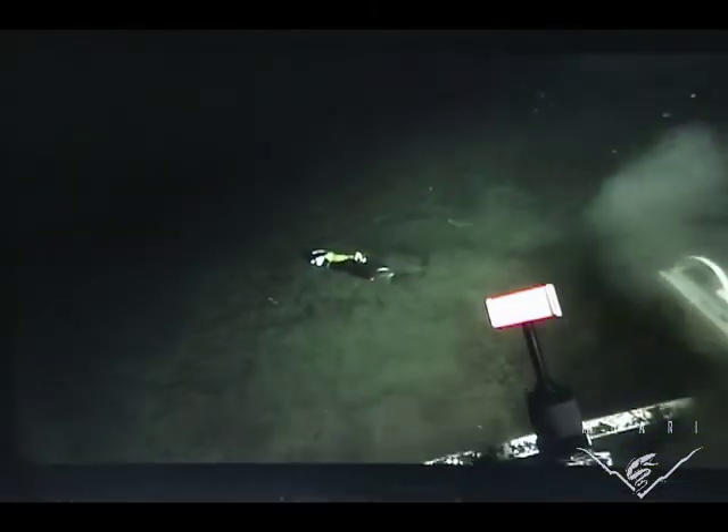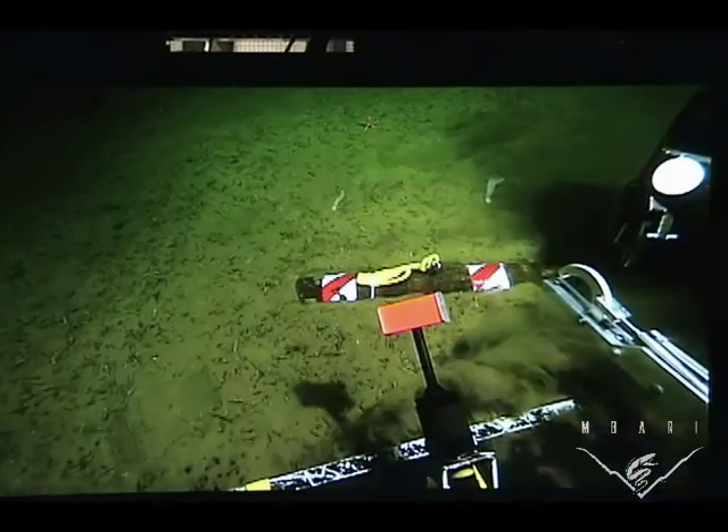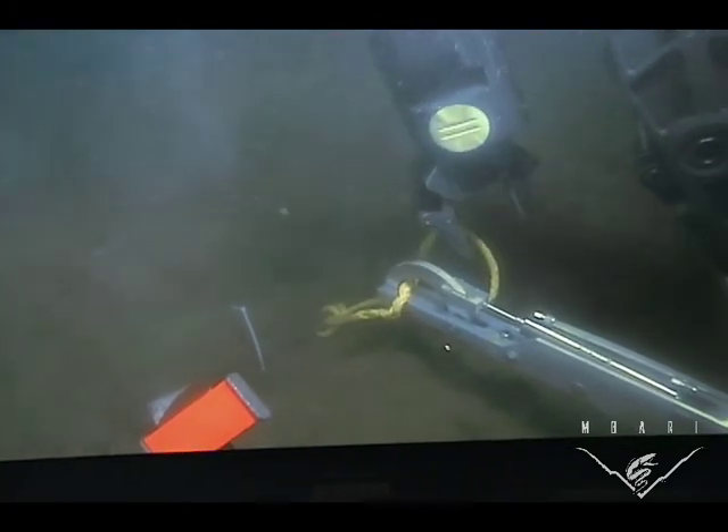And since we are in the sanctuary in Monterey Bay, we can't leave anything behind, so we built this special arm to recover the drop weight, which you see being done here.